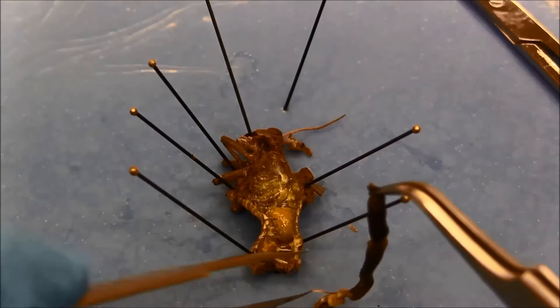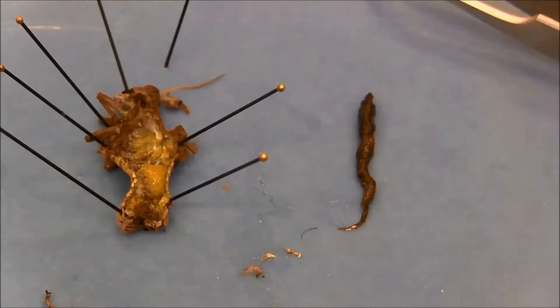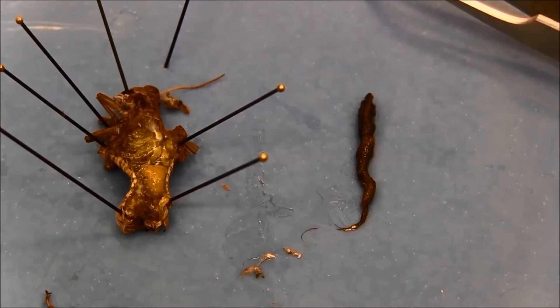Now the gut is isolated and I can immediately proceed with DNA extraction. Or I can store the gut in ethanol in the fridge and do DNA extraction later.